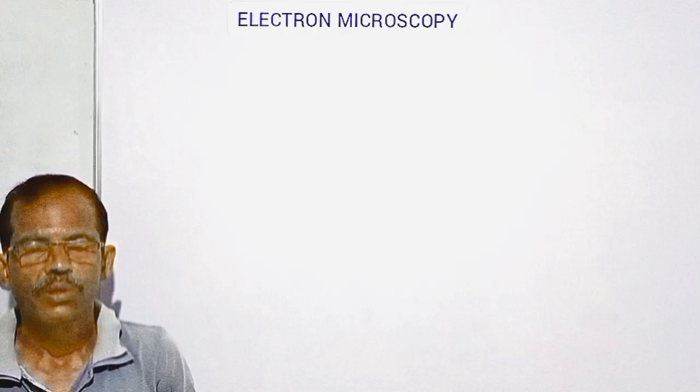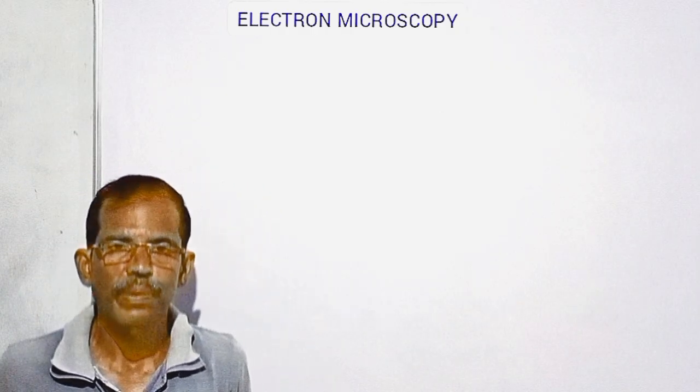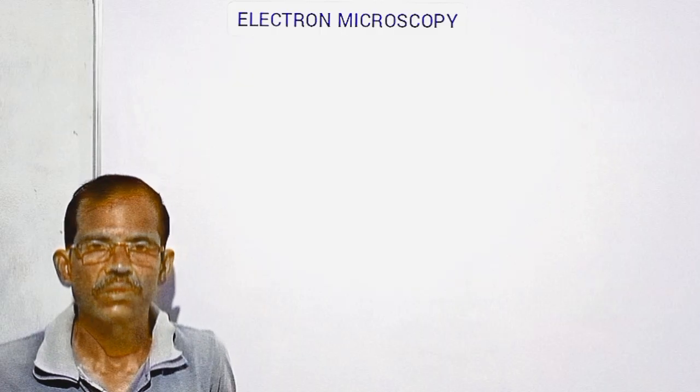Today we will discuss the principle of electron microscopy and its applications.